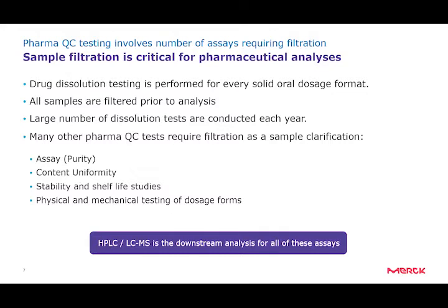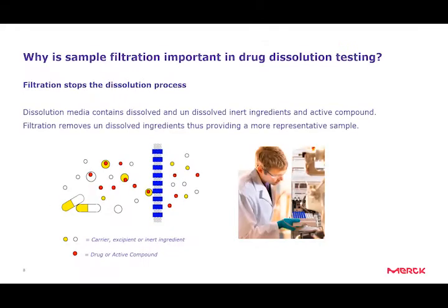There are various other pharmaceutical QC tests that require filtration for sample clarification. For example, assay, content uniformity, stability and shelf life, etc. And in most cases, HPLC or LC-MS is the downstream analysis for all of these assays, where removal of particles before analysis is critical.